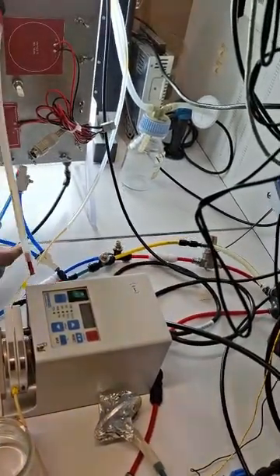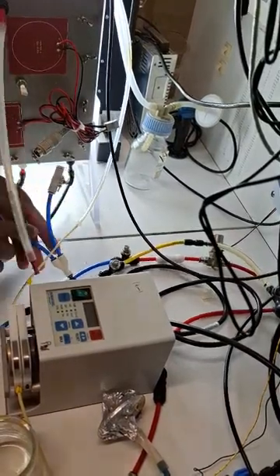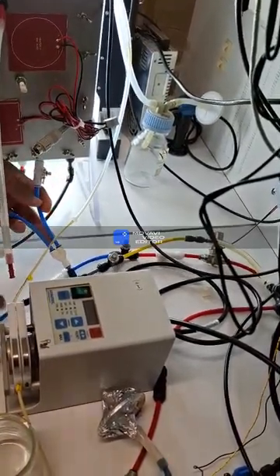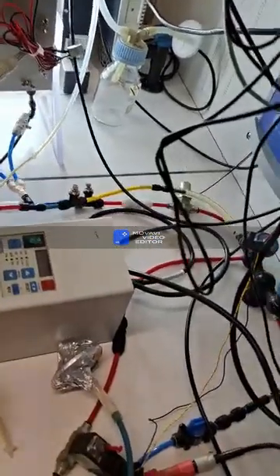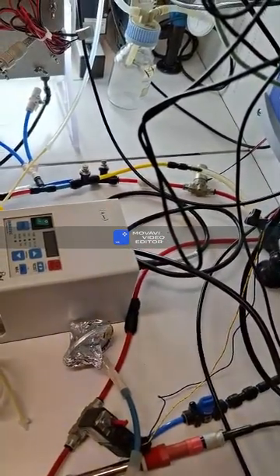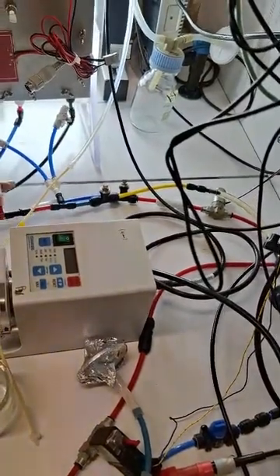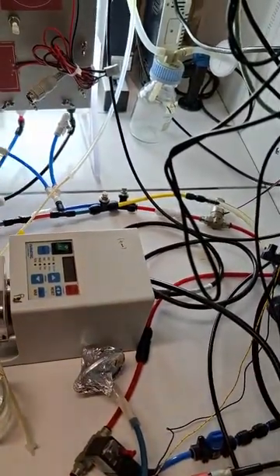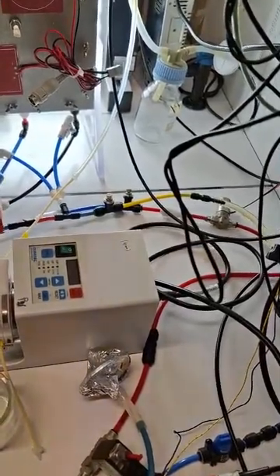And after, it is the same here, but divided by 2? Yes, the same. Here, here, and here it is for carbon dioxide with air. This is separate because this is carbonic gas with the air, that's why it is supplied like this, but this is only air. That's why it is separated into two. Yes, exactly.